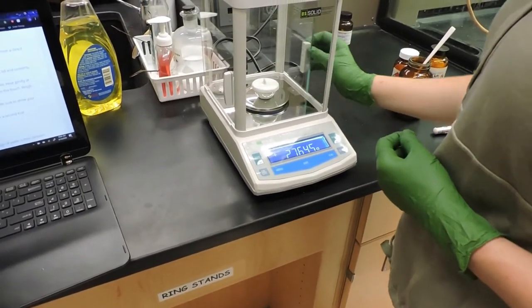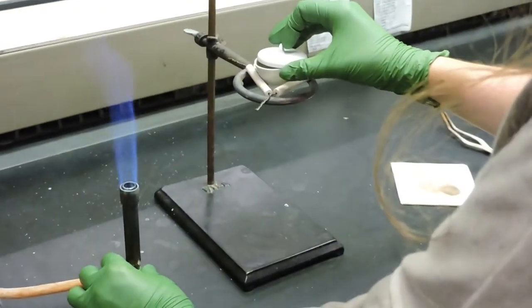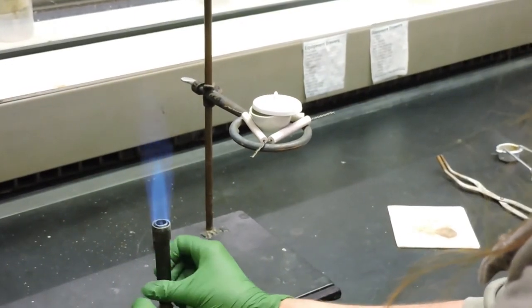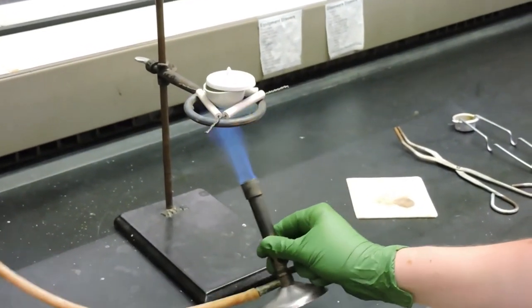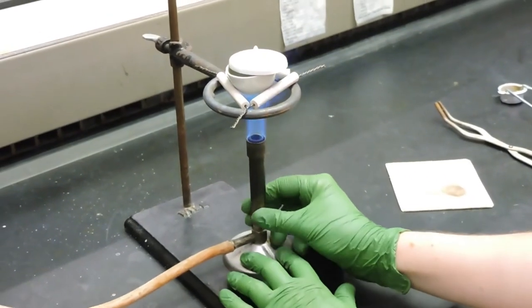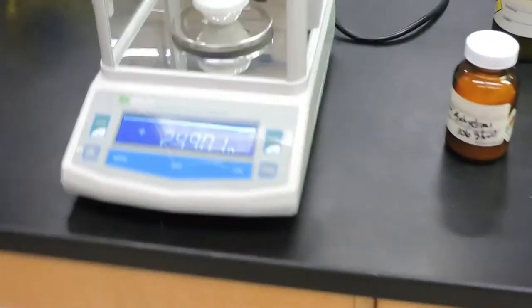Then we'll take this crucible with its contents and place it on a clay triangle with the lid mostly covering the crucible. At first, we will gently heat the crucible using a Bunsen burner. After gently heating, we'll move to a more intense flame and heat for 10 minutes. While the copper sulfate pentahydrate crucible is heating for 10 minutes, we'll go ahead and get the unknown hydrate started.